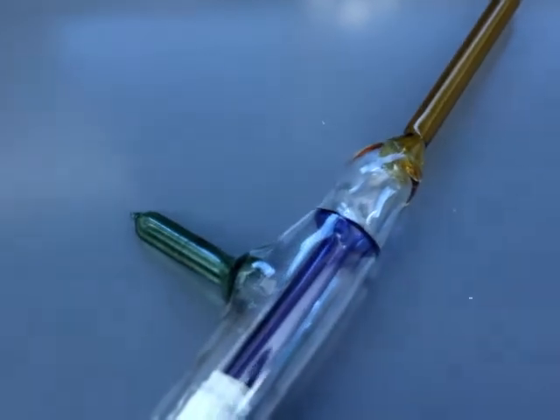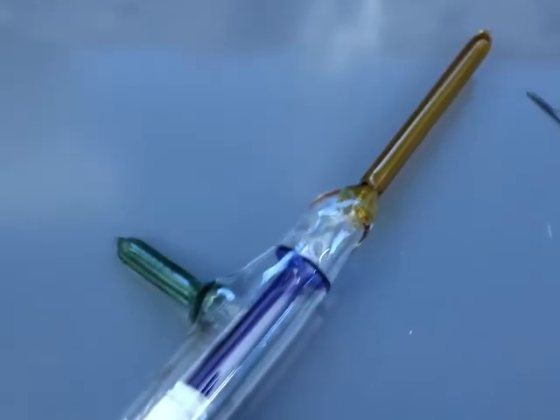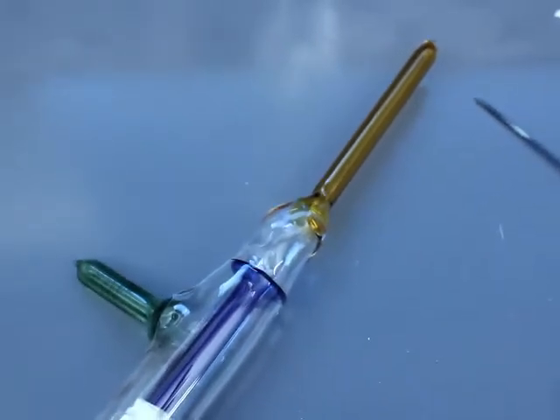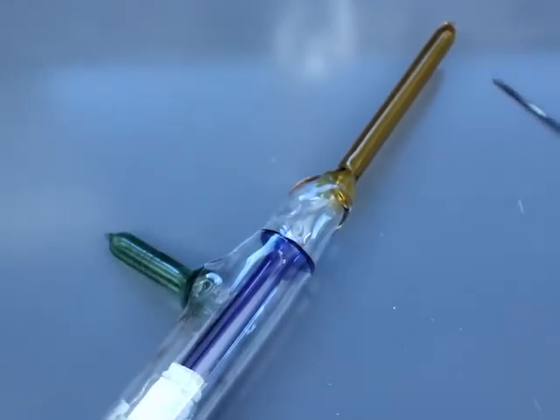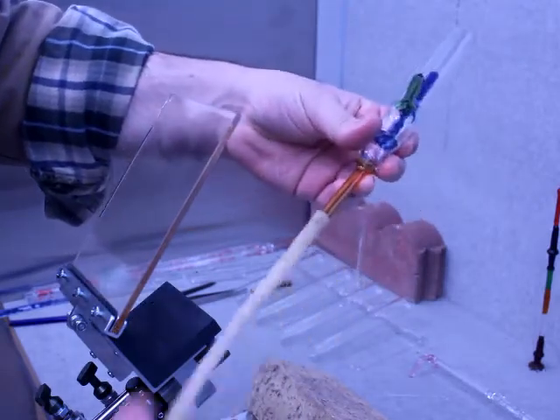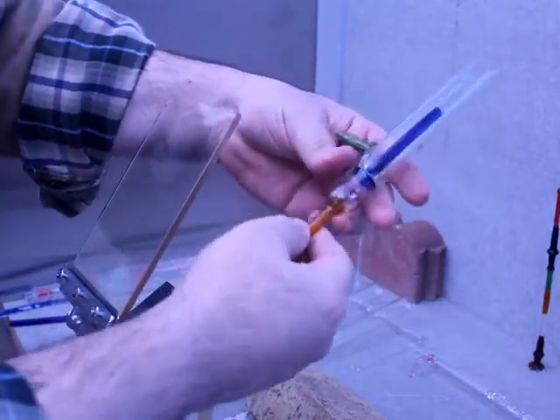I actually looked at it on the polariscope. It has stress, but not a tremendous amount more than it did before the ring seal. My adapter for my swivel doesn't fit this 8mm tubing.